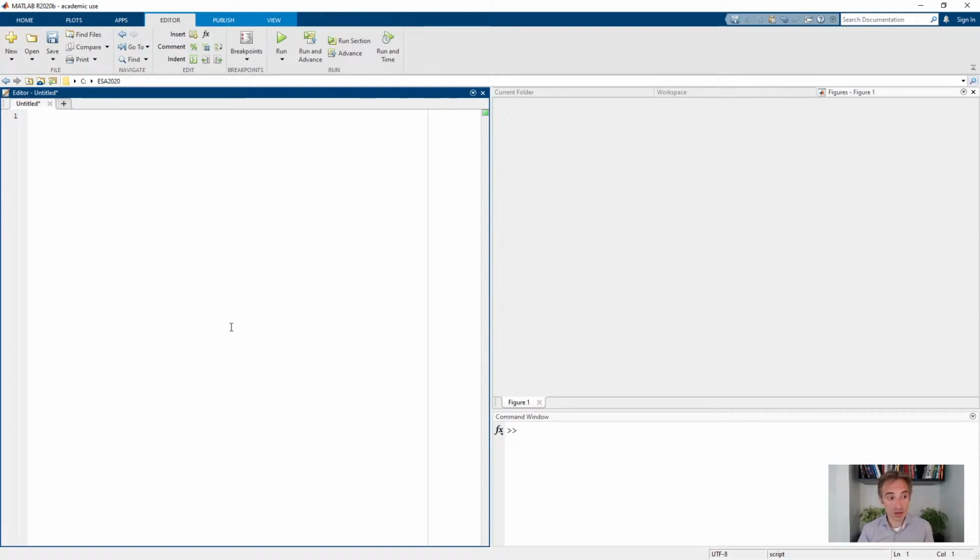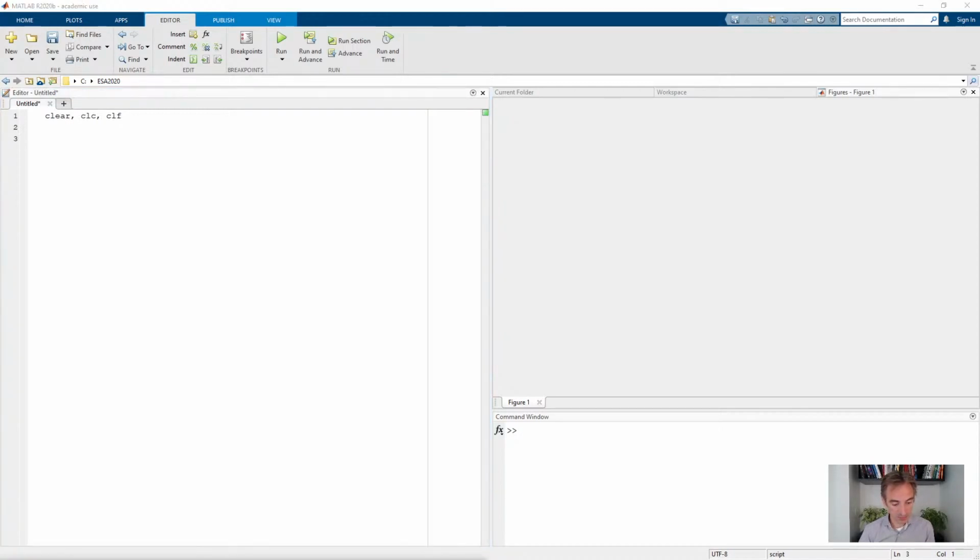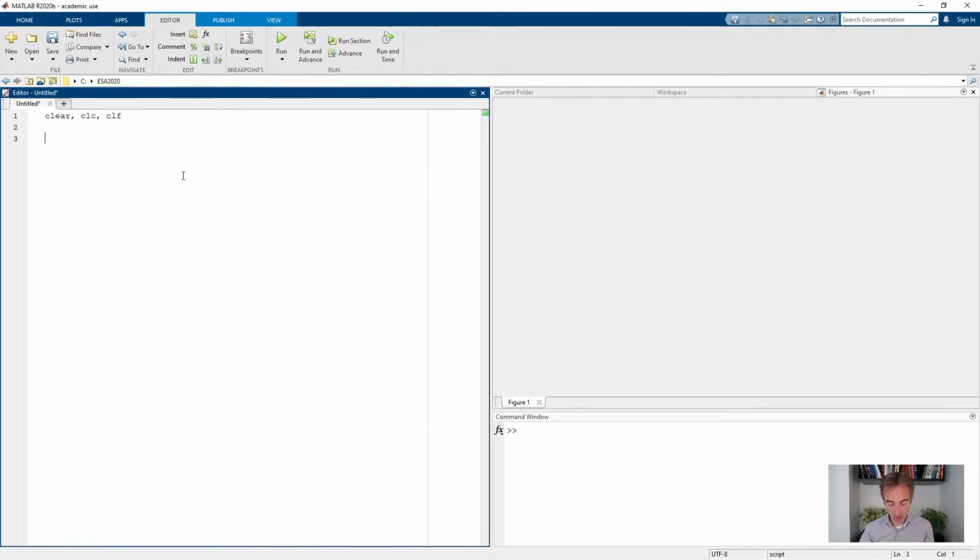So first, let's couple some spin system parameters together for esfit. This time you're going to generate some data. I'm just going to copy some spin system code up here. We take a g value of 2. We're going to use 3 different proton classes.